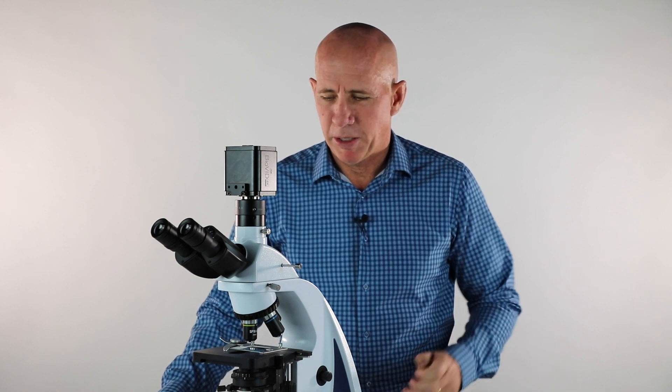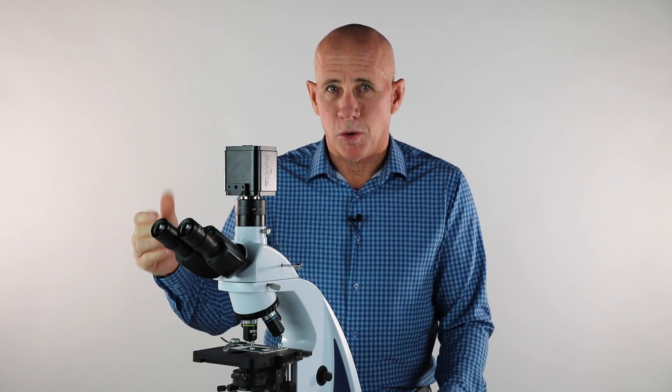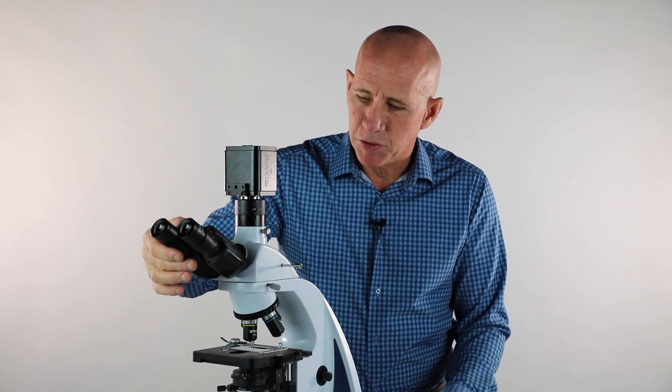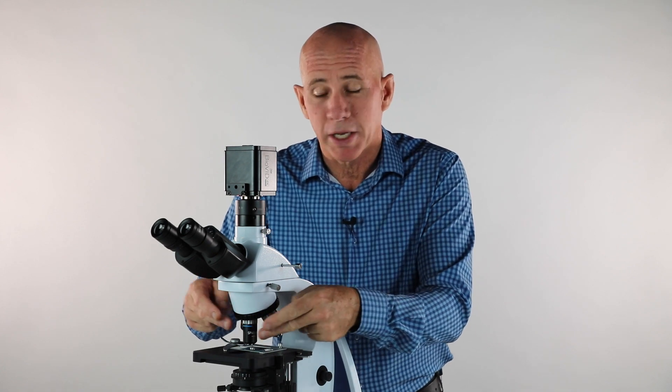Also in the box, when you removed your trinocular pipe, you would have found the Allen wrench — it's a three millimeter Allen wrench used to focus your trinocular pipe. The idea is to have the camera image on the screen par focal with the image you see through the eyepieces. To do that, first focus on something at 40x — the higher magnification you'll spend a lot of time on, since it's more critical at tight magnifications.